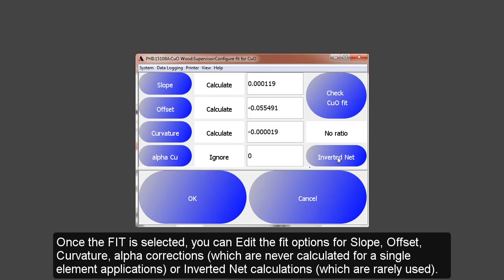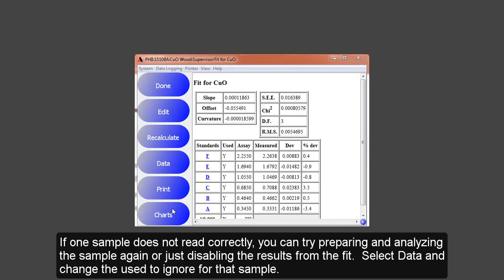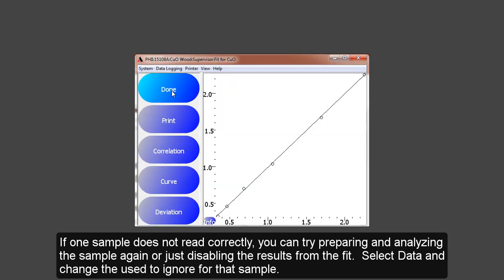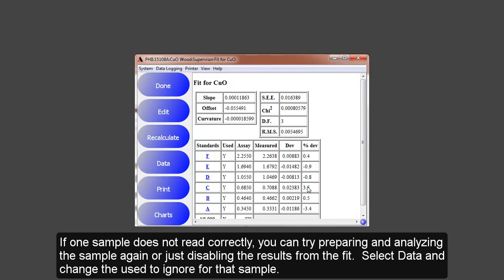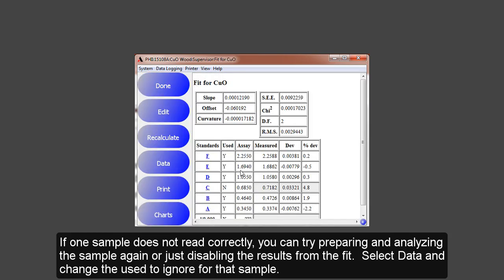The alpha corrections and inverted net are rarely used. The goal of selecting a fit is to pick a valid setup with the lowest standard estimate of error. A valid fit will have a positive slope, an offset value that is less than the lowest standard concentration, and a curvature with a small absolute value. The SEE is normally about 1% of the highest standard when using a set of well assayed standards for simple applications. Once you complete the calibration fit, you can look at the correlation plot. Or if you have one sample that you feel reads worse than the others, you can go to data and disable that sample. Now it is not used in the fit, and you can see the error is a little bit better.